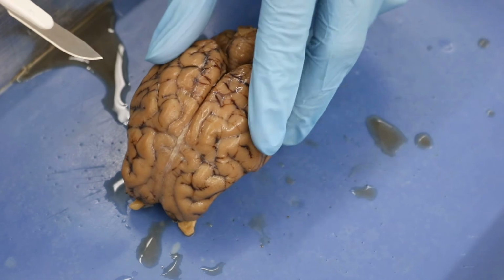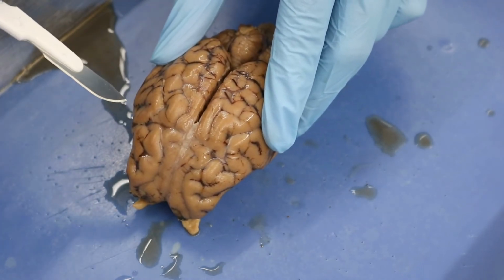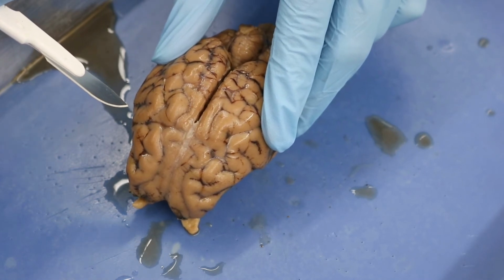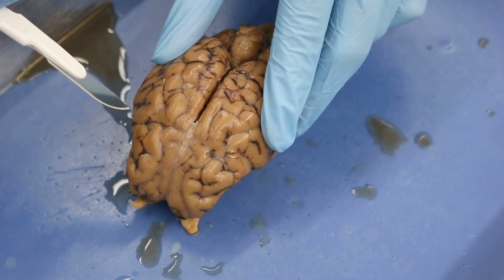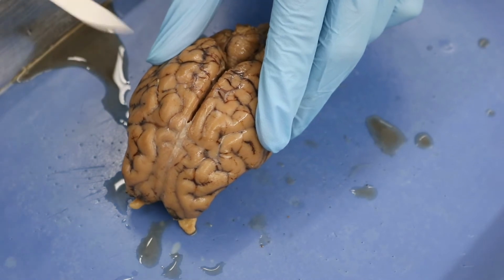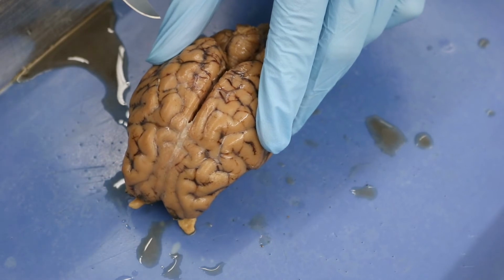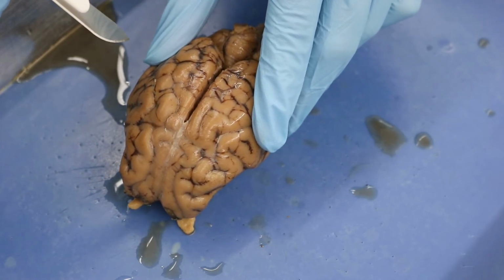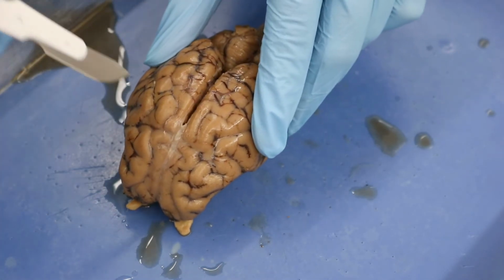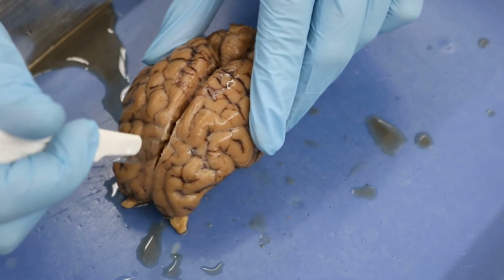You also always want to anchor what you're cutting so that it doesn't wobble around. If you have ever tried to cut a grape, let's say, and you wanted to cut a grape in half but you didn't hold it still, wouldn't work very well, okay? It's going to fly all over your plate. So you always anchor your specimen, you cut away from yourself, and I said 2 things, but I'm going to add a third one. Make small, smooth cuts, okay? Don't just go, because then if you do something wrong, you have no way to fix it. But small, smooth cuts. So what we're first going to do is we're going to cut through this portion.